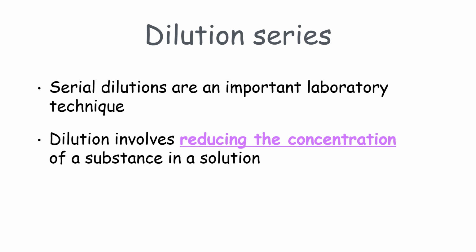You might have weighed out something incorrectly. You might have transferred something incorrectly. If you make a concentrated solution with error in it, every time you dilute it down by adding in water, you're actually diluting your error and you're making your concentrations more accurate. And so it is a way of minimizing error, as well as allowing you to take one concentrated solution and produce many different concentrations of diluted solutions from it.